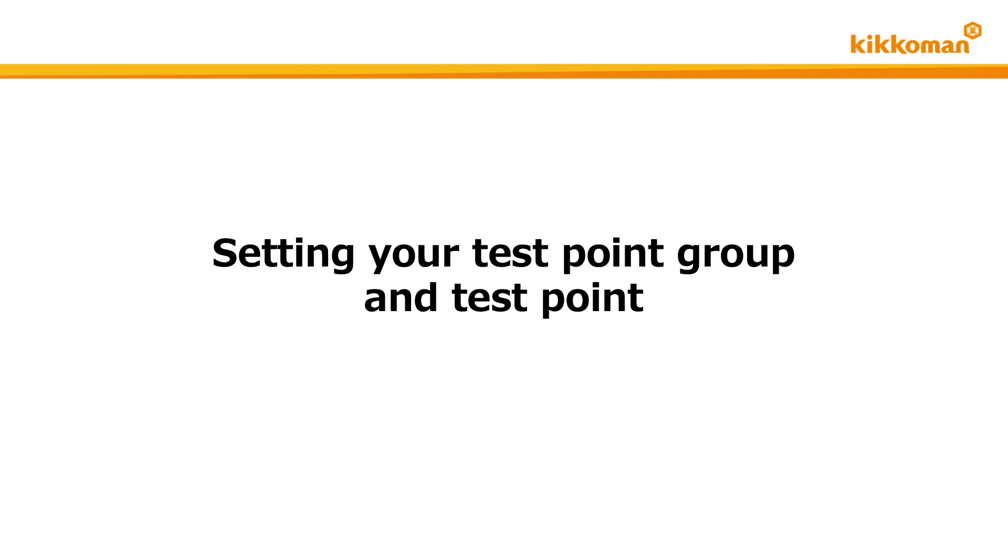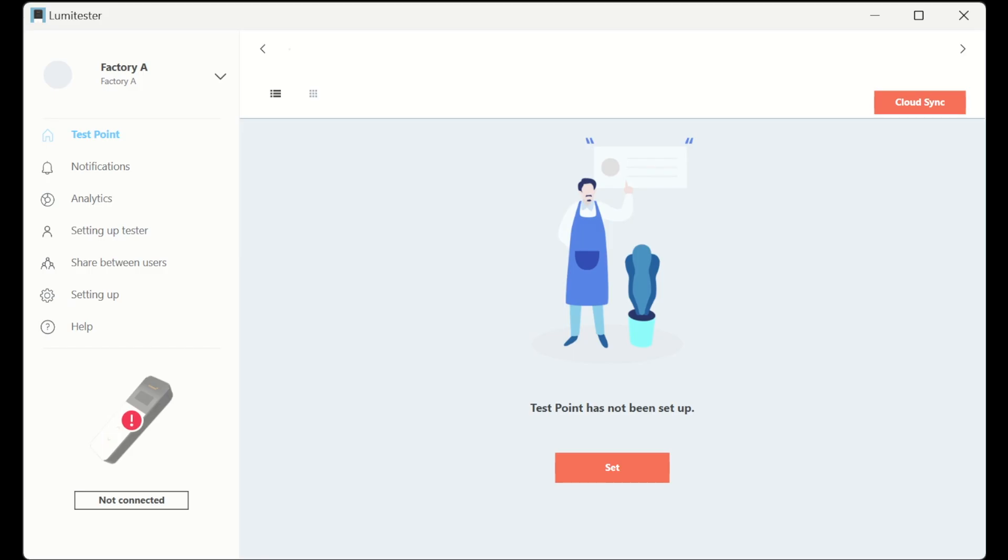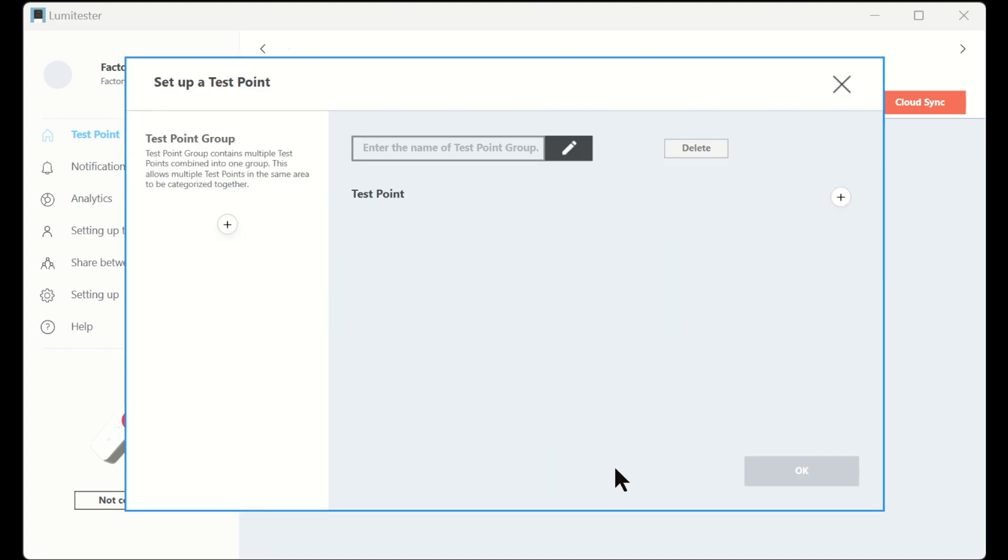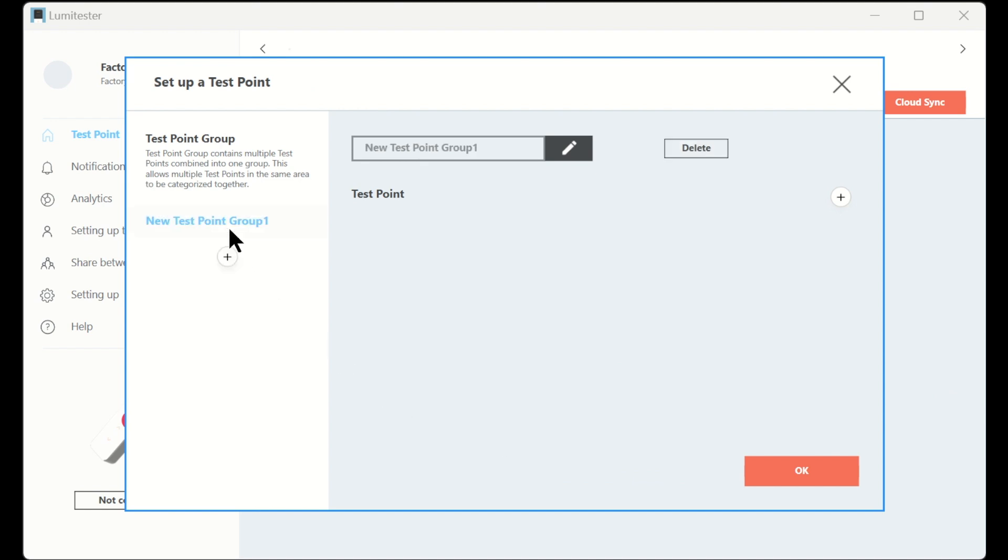For the first time log in, you need to set your own test point groups and test points. If you are using a PC or tablet, you will see the screen now showing in this video. Click or tap the set button, then click the plus button on the left side of the screen. Next, click the edit button to enter the name of this test point group.